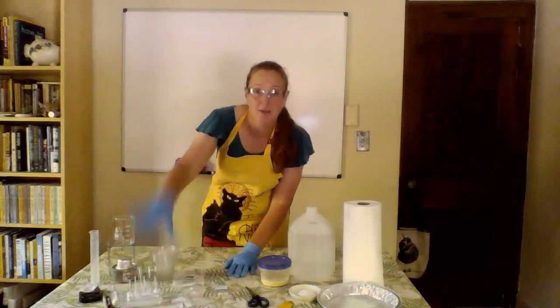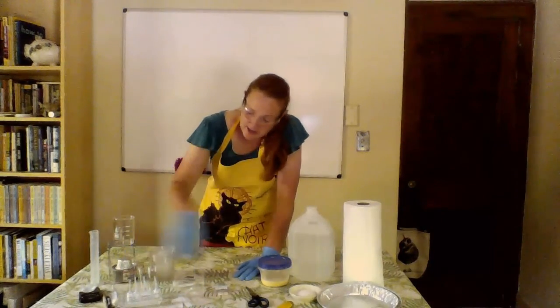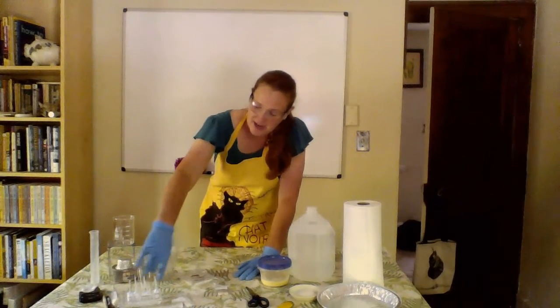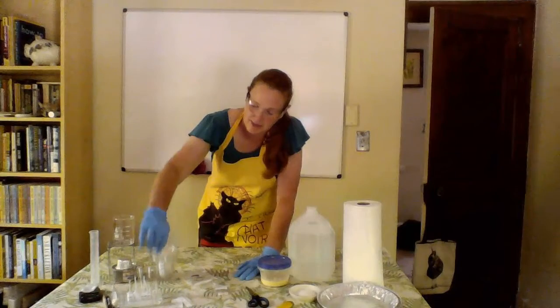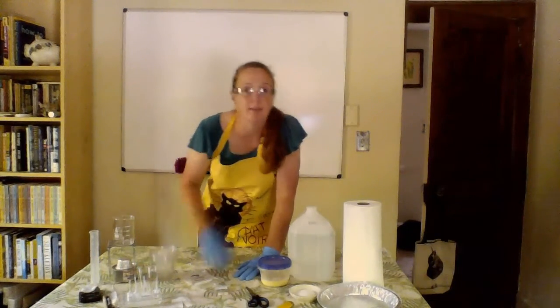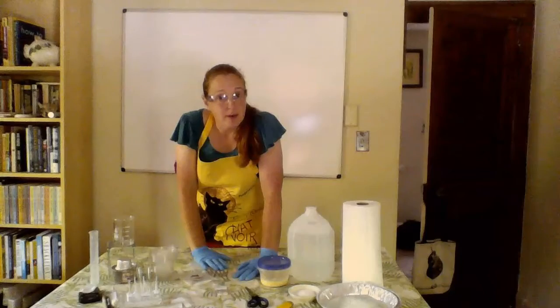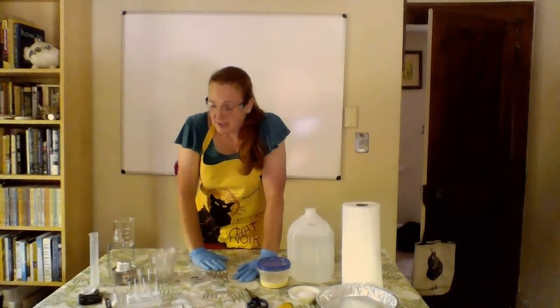So over here on this side where I have all of my hands-on lab kit supplies, the one thing that I did was I did break open the bag full of supplies, and you'll notice in the pictures that they've got all of these little containers sitting with the tip up. So go ahead and get that set up early on in your experiment, or keep in mind that this is one way to store those little containers.